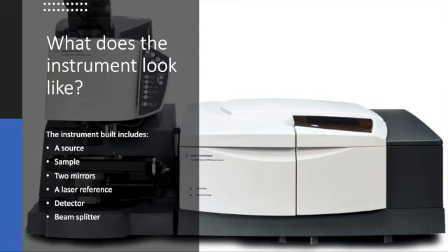Now the instrument looks like this, seen in this slide. It has a build that includes a light source, a sample, 2 mirrors, a laser reference, detector, and a beam splitter. All these together make up the device that's seen on this slide and get the readings for the FTIR.